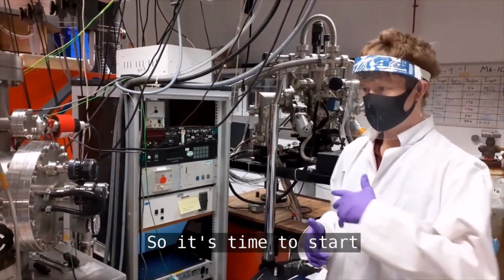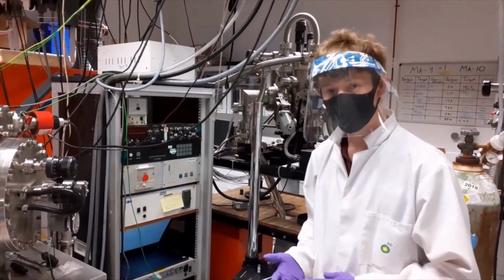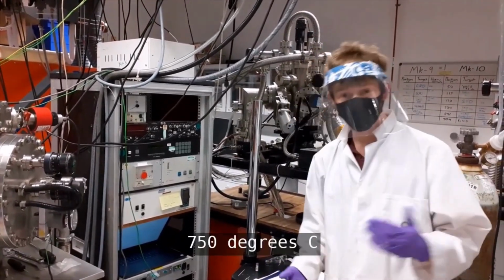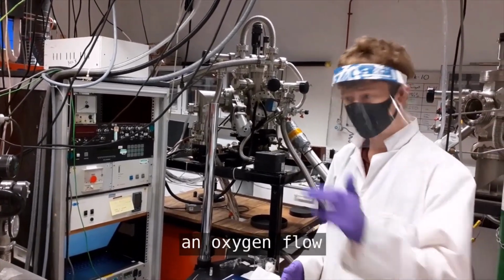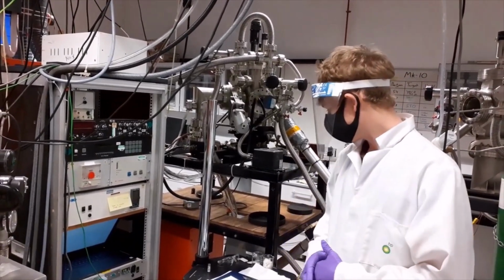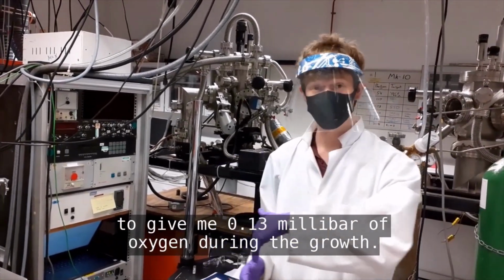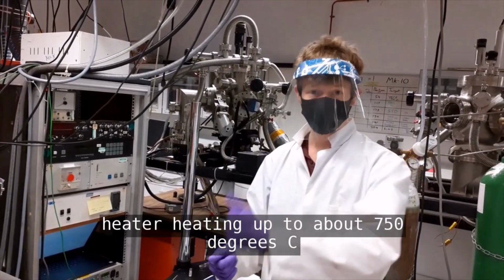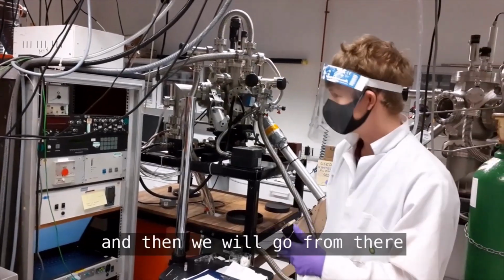So it's time to start preparing the deposition conditions as we actually want them. For the growth I'm doing today, I want 750 degrees C, and I want an oxygen flow to give me 0.13 millibar of oxygen during the growth. So I'm going to start by setting the heater, heating up to 750 degrees C, because that takes the longest time, and then we'll go from there.